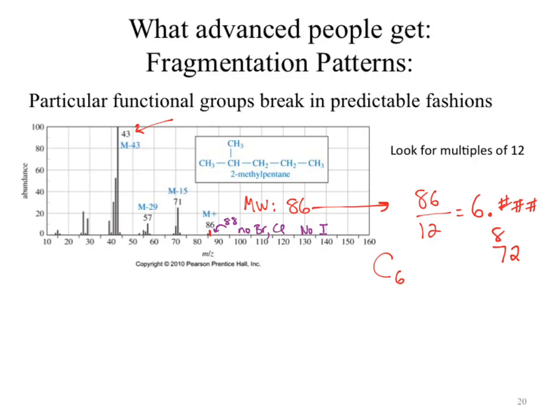Okay. What happened to that other mass? That difference is now our hydrogens, which is, I don't know my multiples. It says 7 and change. Man, who's got a calculator? Only in organic chemistry. I will adjust that in a second. So 84. Fix the math. There we go. So we'd come up with a possible formula of C7H2.